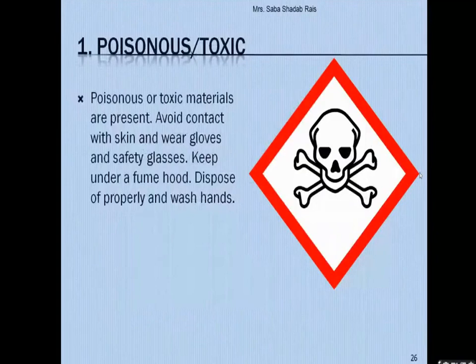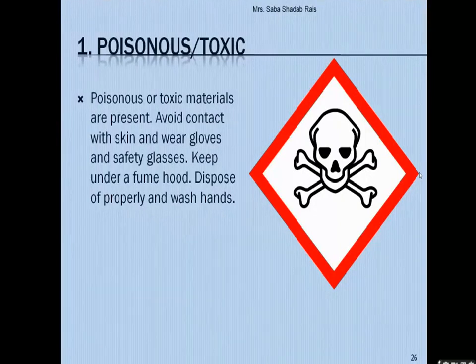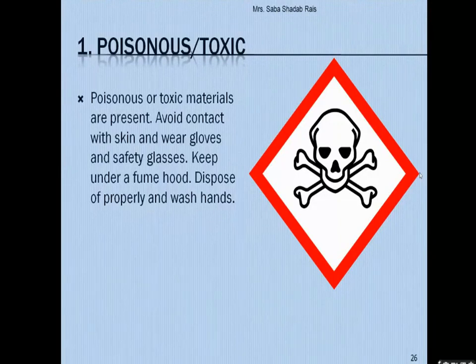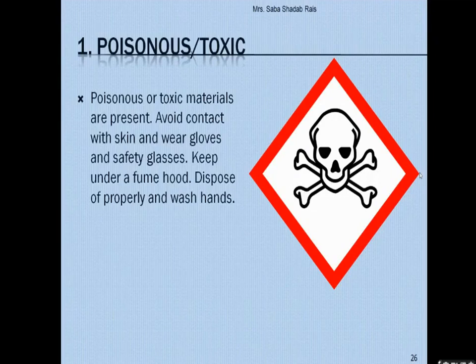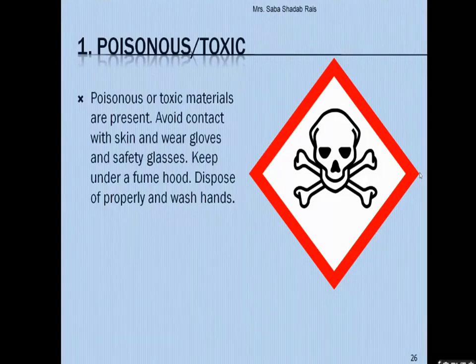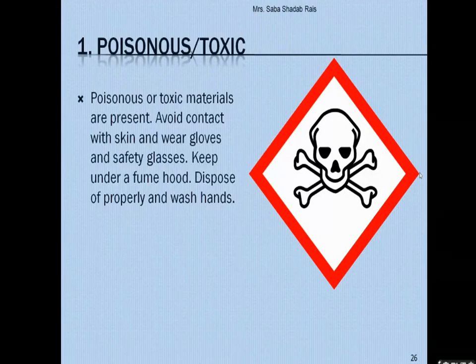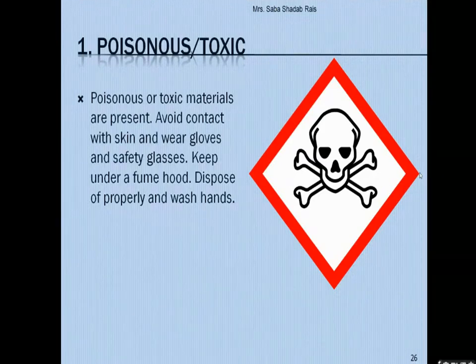Now we will discuss each symbol. First is the poisonous or toxic symbol. All chemicals or their mixtures that are harmful to the environment or human health if inhaled, swallowed, or absorbed through the skin or various ports of injury are called toxic chemicals. Some of these chemicals express toxicity only after long-term contact — these are called chronic toxic chemicals.